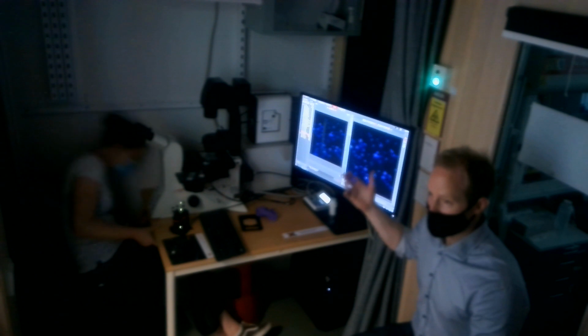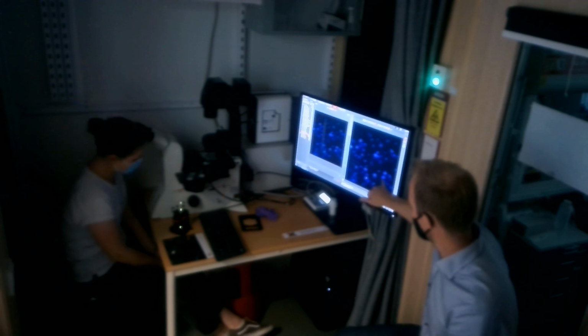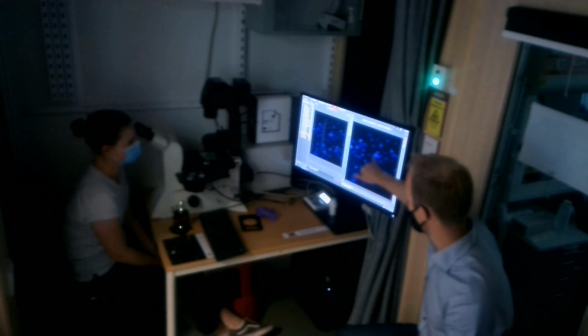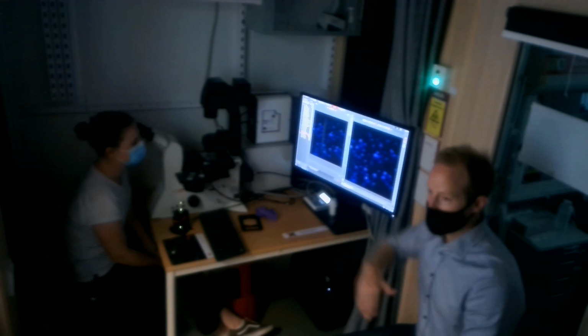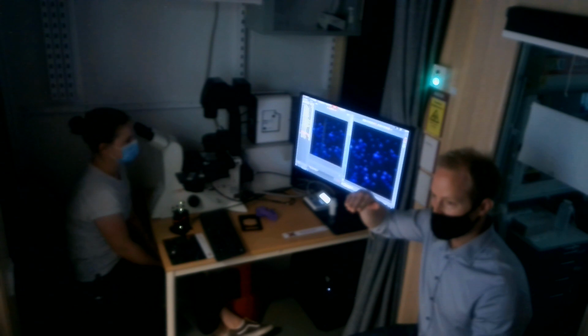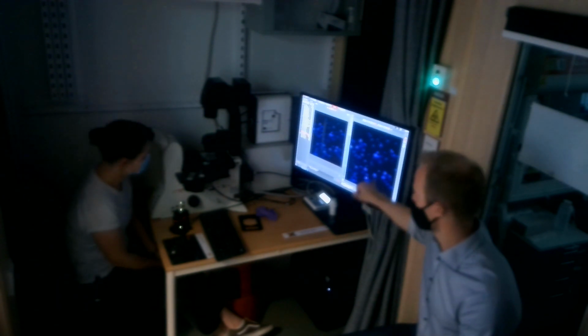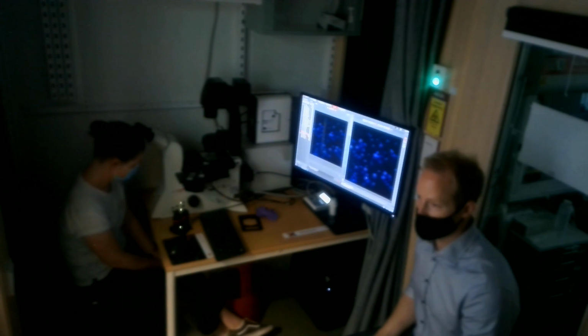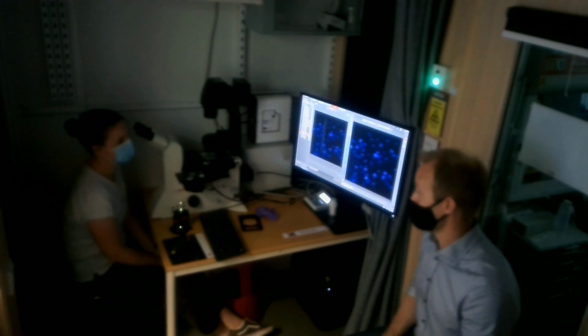This extended depth of focus will better remove this halo, because the halo is diffuse. So on that level where you have a lot of this diffuse, it might not pick up anything at all. So that one would probably work a little bit better to get better contrast here. So that could be an option. That's a license that you don't have. We can test it.